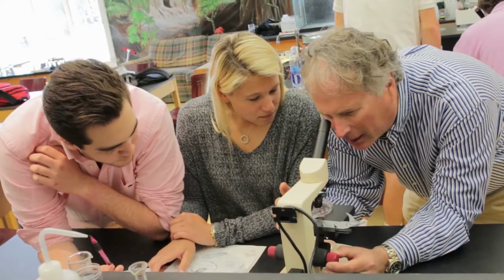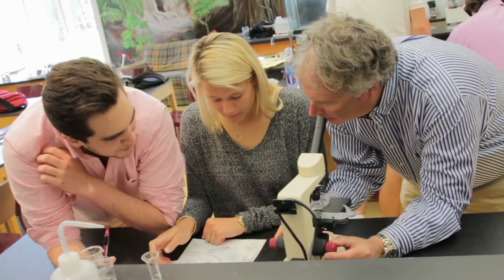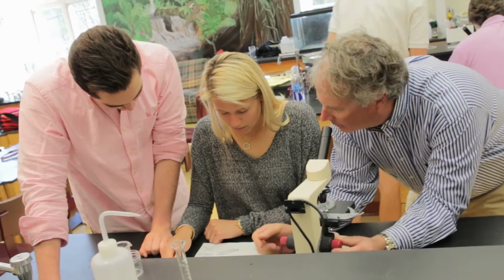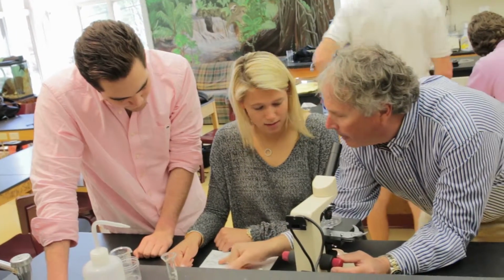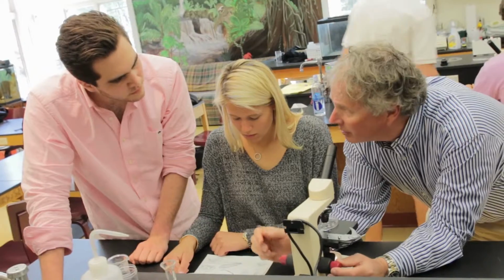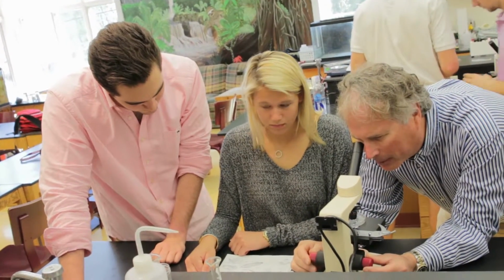You know what? I think he's a copepod. A copepod. Yep, that was my second notion. So not a rotifer, more like one of these daphnia or copepods down here. Does he have that clear shell around it? Yes. The problem is the drawing shows so many legs, and you won't always see them because he'll tuck them in. You won't necessarily see them when he's sitting in a sample like this. That would be my bet. Take another look.